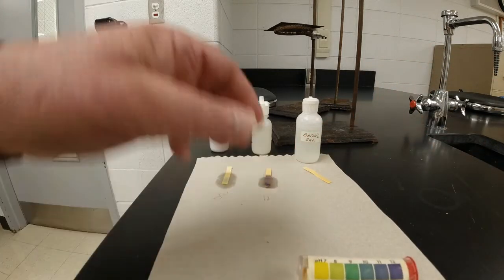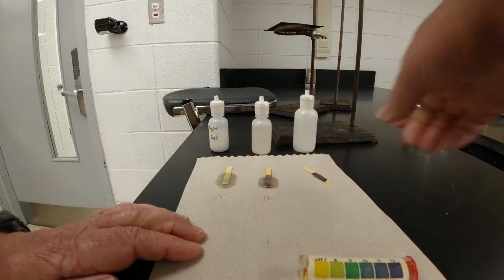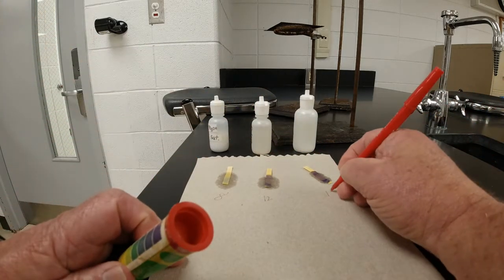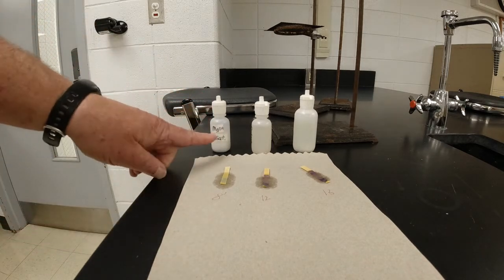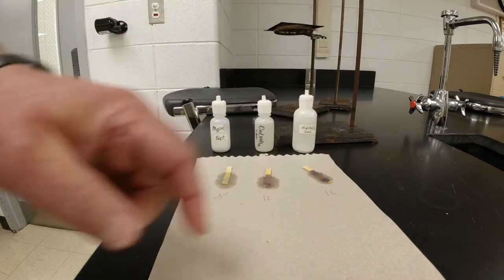And then last of all, we're going to put the barium hydroxide on here. Put a drop of barium hydroxide on. And that one's even darker. All right, but that only goes up to a 12, but that's probably a little bit darker 12. So we're going to call that 13. All right, so we're going to write those things down. The magnesium hydroxide's an 8. Calcium hydroxide's about a 12. And the barium hydroxide's about a 13.